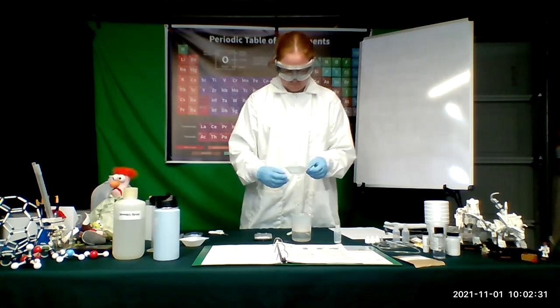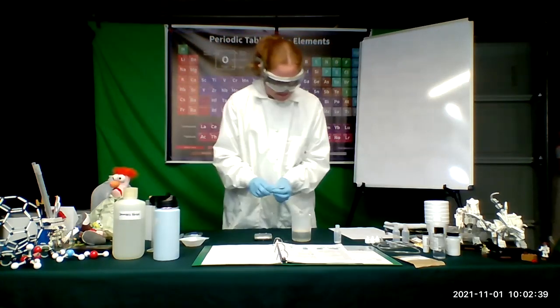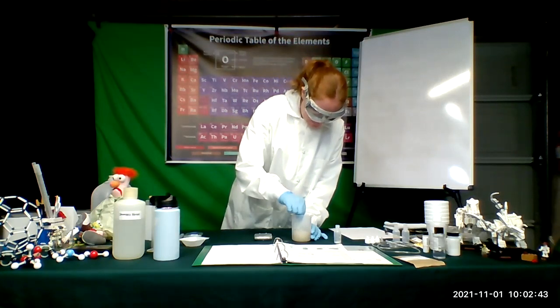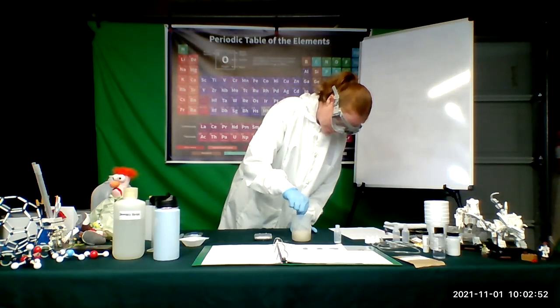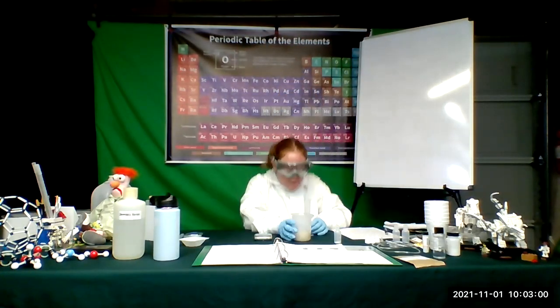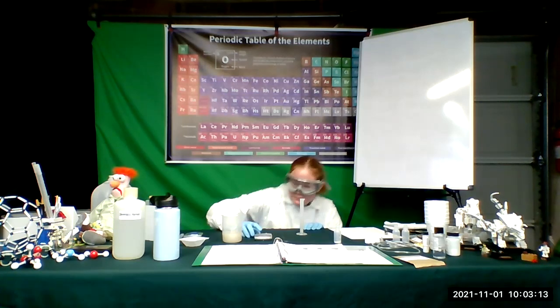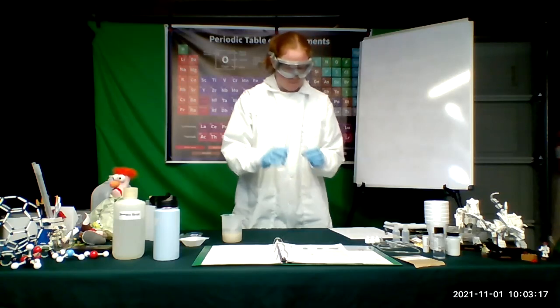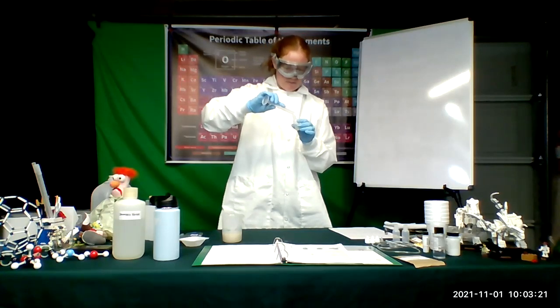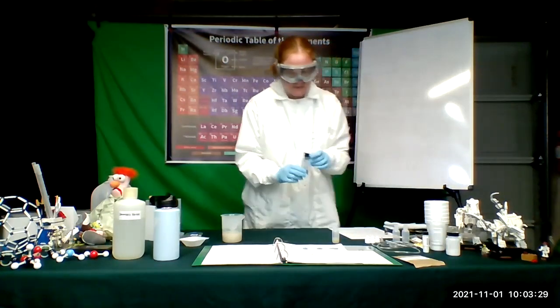And then I'm going to add this yeast to my hot water. I'll put this weigh boat aside because it is now dirty and I will need to clean it before I can use it again. Now we want to stir our yeast in our hot water. There's my yeast solution. And now I need six mils for each small bottle, so I'm going to go ahead and measure out my six mils for the bottle I'm working on. I'm going to put my yeast into my bottle — it's going to start using the sugar as an energy source and consuming it.